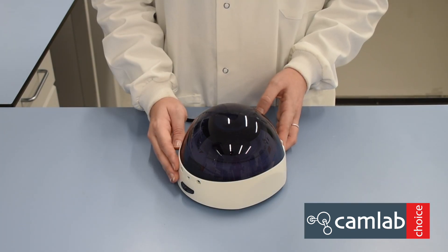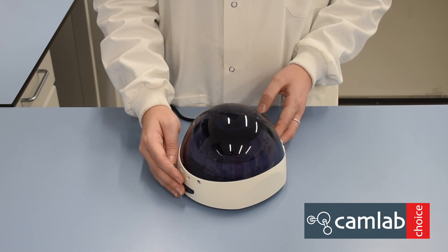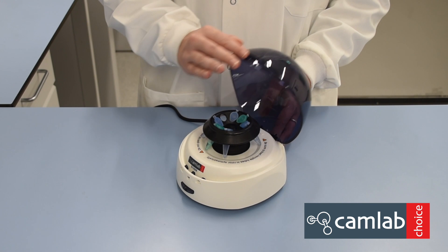Switch off the centrifuge at the back of the unit and the rotor will gradually stop spinning. Once stopped, open the lid and remove your samples.